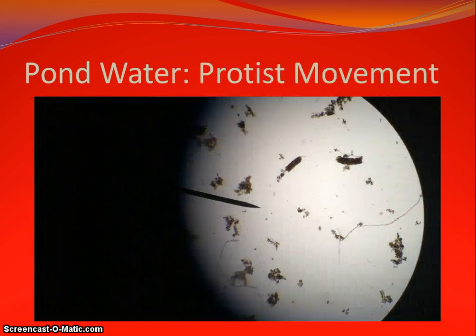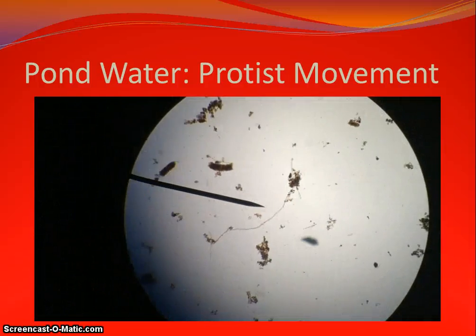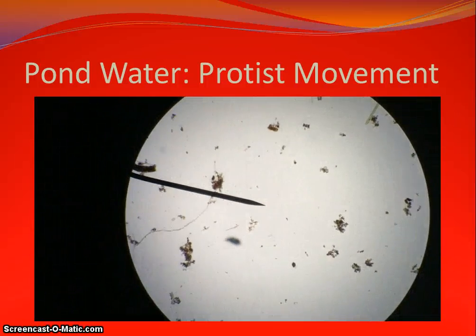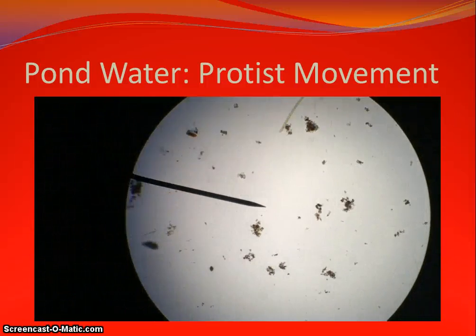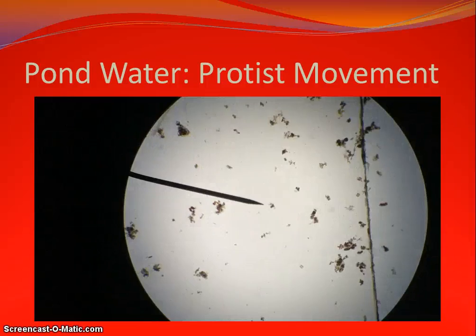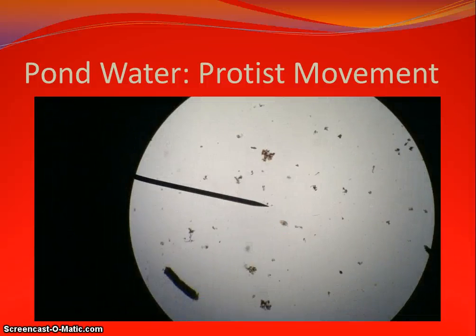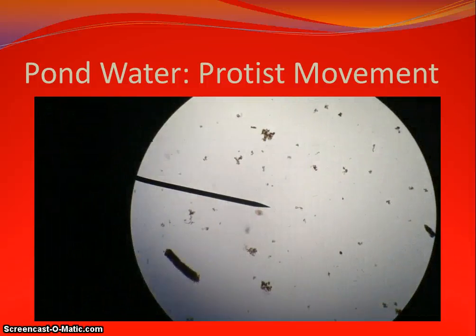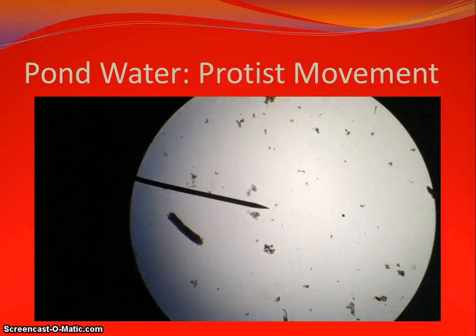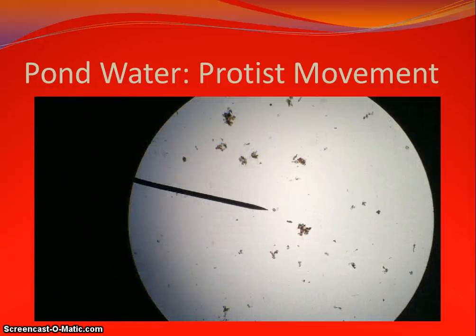Here is a video of our pond water in which we can see protists moving as we are moving the stage, and you can see that several protists towards the bottom are moving, and of course they are moving through their flagellum and pseudopods, although it's kind of difficult to see. And those were some examples of the protists that we saw within our pond water.